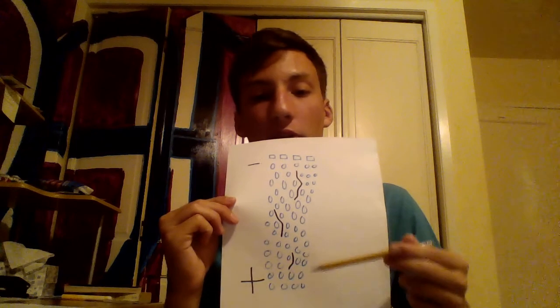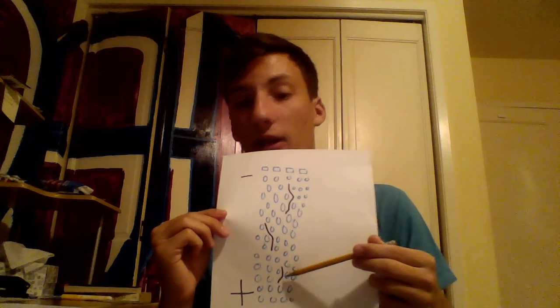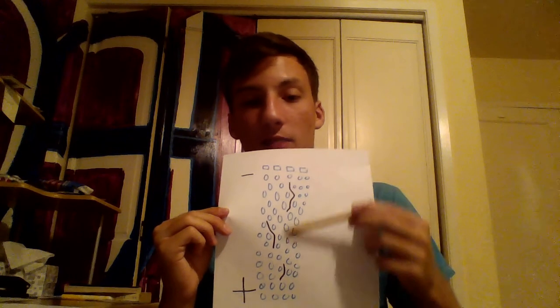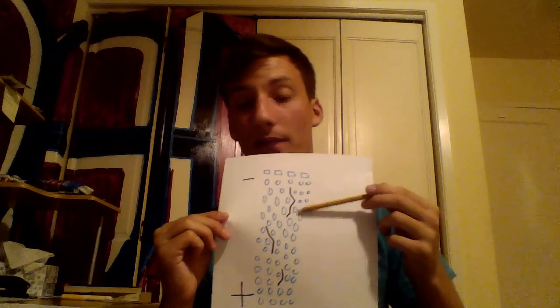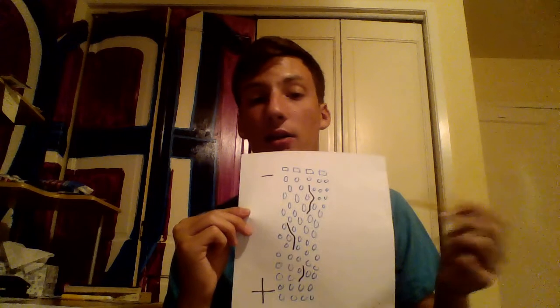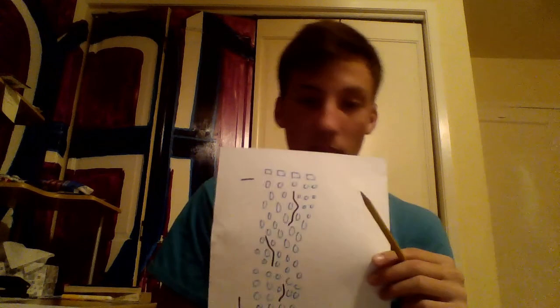One thing you'll notice is that the smaller DNA moves more quickly through the gel. So the smaller, the farther it will move. The larger, it'll move less. So that's something to keep in mind. And after we run this gel, we can actually look at it and estimate how many nucleotides are in our insert. So let's look at that.